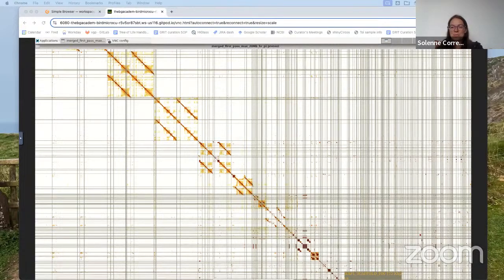Thanks for playing about testing all of that. From playing about with it, my initial impression is that, because often with birds, when you get down to the very tiny bits, you're kind of saying, well, that looks like it's on its own, and we think it looks like a chromosome, and that looks like the other haplotype of that chromosome, but really you just can't see any detail, or you're kind of guessing a bit too much about what represents one chromosome and if there's any errors on it. With these reduced maps where you can see more detail, I think there's less guesswork because you can see more of what's actually going on.